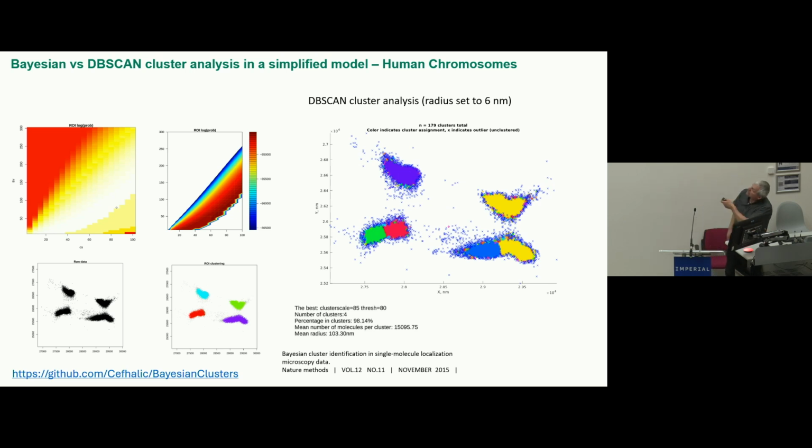For a single chromosome, it could take a couple of hours on a 1 terabyte RAM machine with 48 cores. Then HPC makes it practical to analyze the pattern of these points. But this is a tiny area. When you go to an area like 100 microns in diameter and you want clinical applications, this need for computer resources is no longer practical.